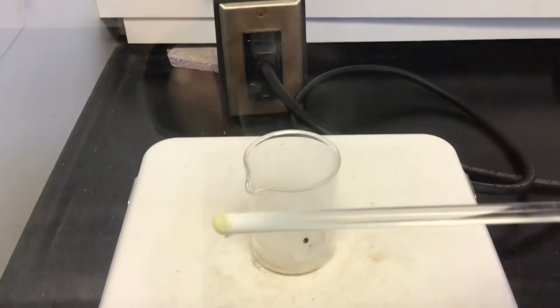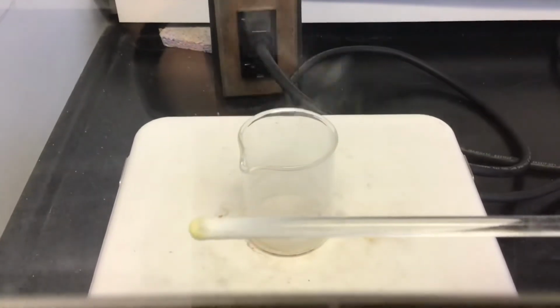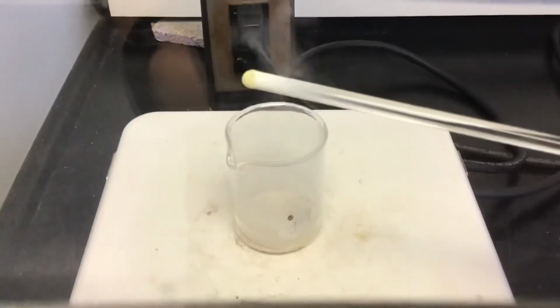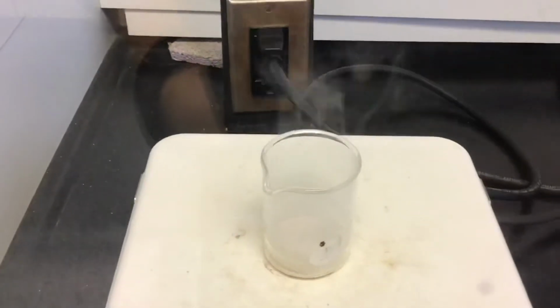My stir rod has white on the end of it. You see that? And a little bit of yellow. That's just the sublimation of ammonium chloride. I'll have to rinse that with water to get all that out as we proceed.